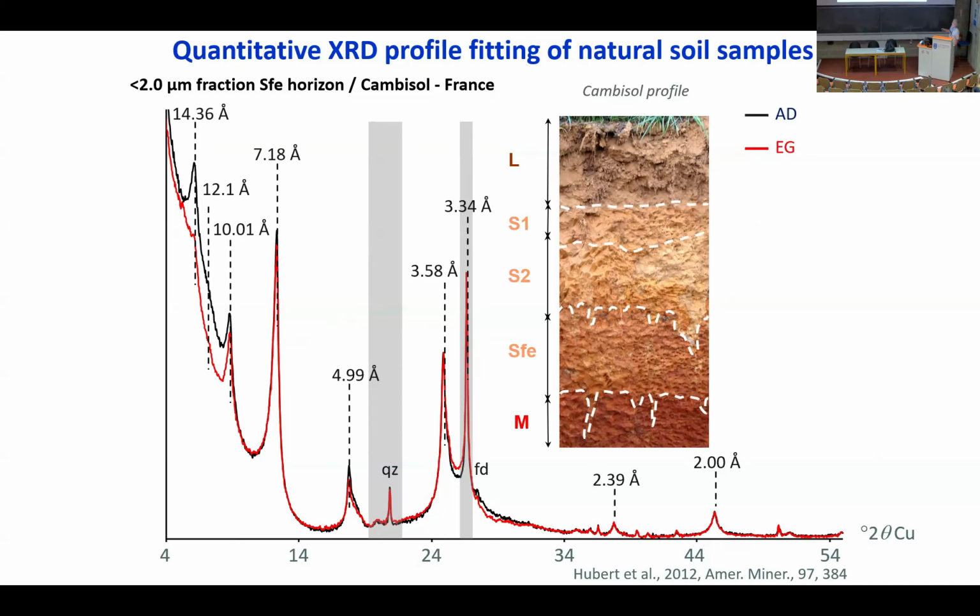So I probably have chlorite here, I probably have a mica contribution, I probably have a kaolinite contribution, and I probably have a mixed layer containing at least mica and some expandable interlayers, and we will even consider the presence of chlorite in that interlayer.